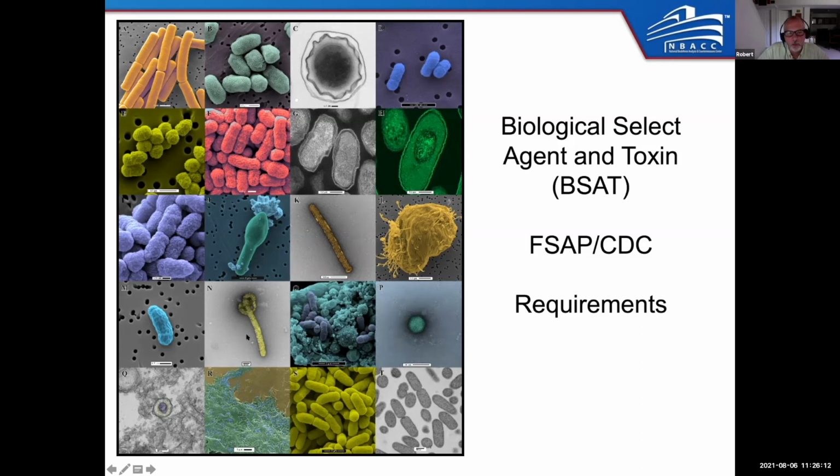This is actually a Marburg virus. This is something called Rift Valley fever. So we look at lots and lots of cool things, right? This is our newest things right here on Q and R, right? So Q is a TEM and R is an SEM.